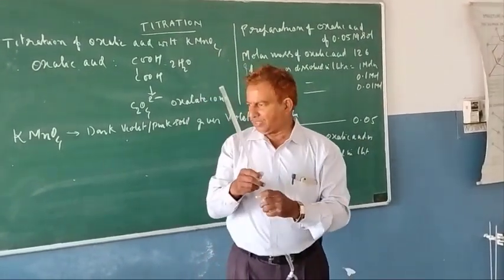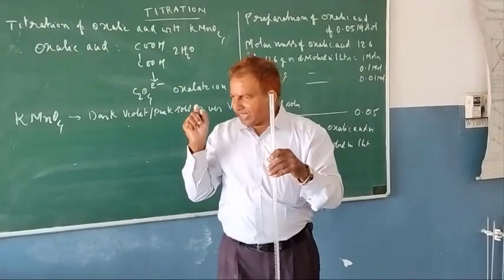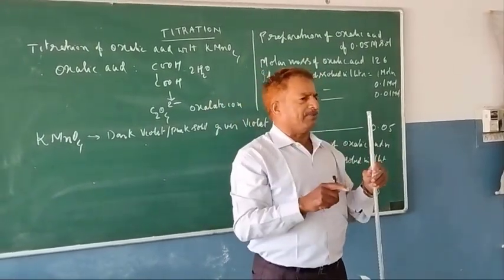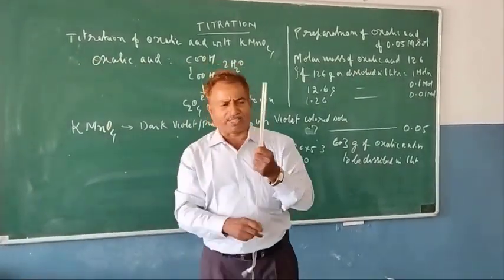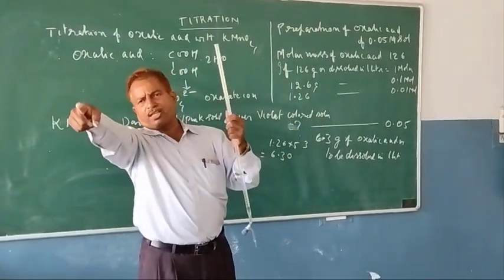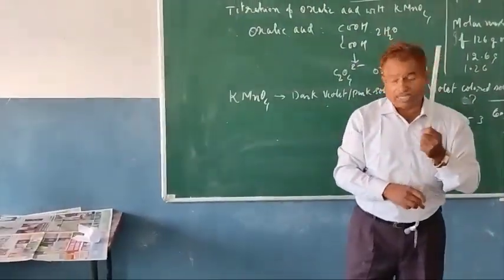Then fill it. Right. Now while filling the burette, take it out and pour. Take care that no chemical falls on your hand. So it shows your accuracy. Right, your concentration will be right. Now once the burette is filled, the burette is fixed to the stand, the burette stand. It's not a tripod stand, it's a burette stand. Right.